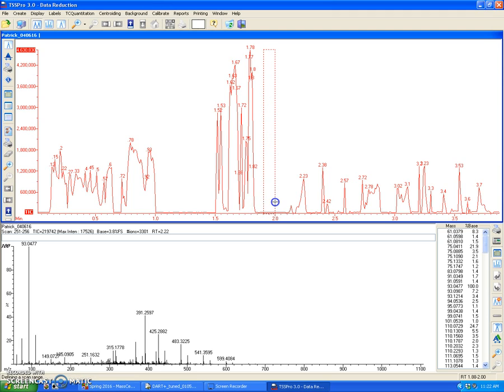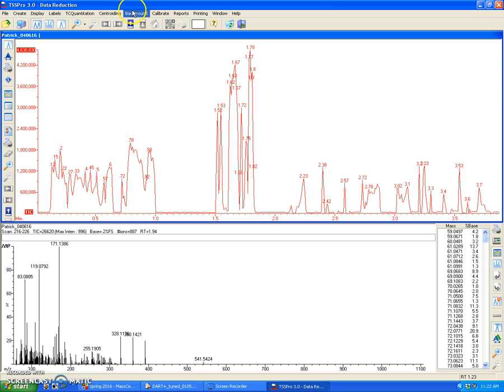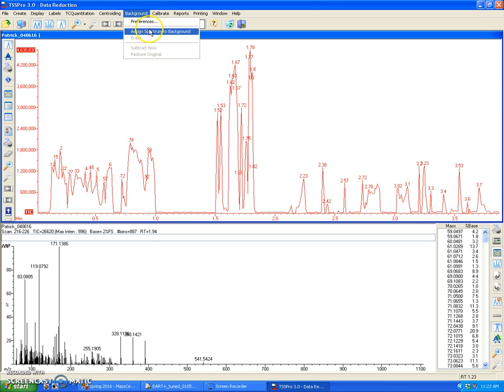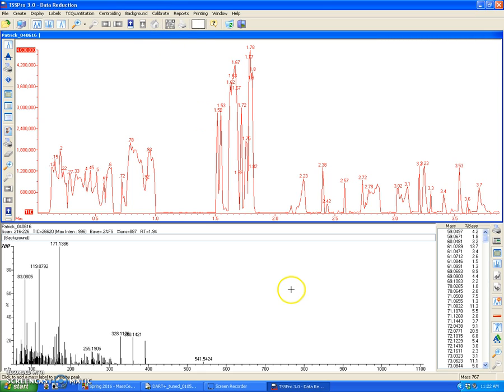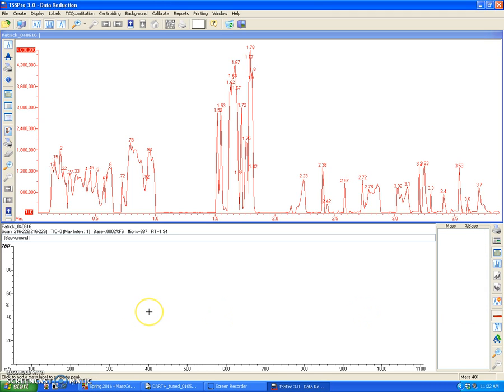So to do that, what I'm going to do is average a blank region, where I input no analyte. And you can see that there were ion intensities that were acquired, and I don't want that interfering with any of my analysis. So I can go to the menu up here, click on background, and then assign spectrum to background. And so, now that the software knows that this is a background spectrum, if I click on this button right here, subtract MS background, this will disappear because this has subtracted itself.